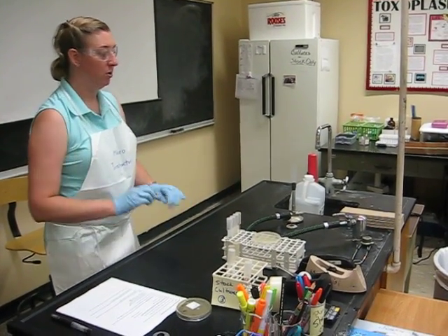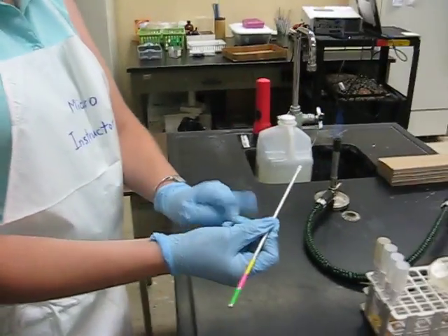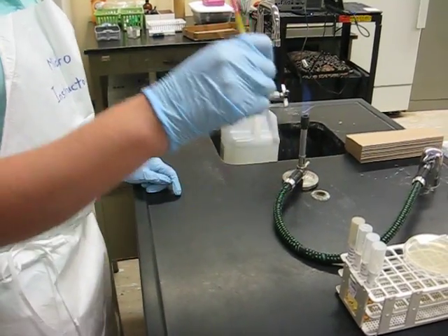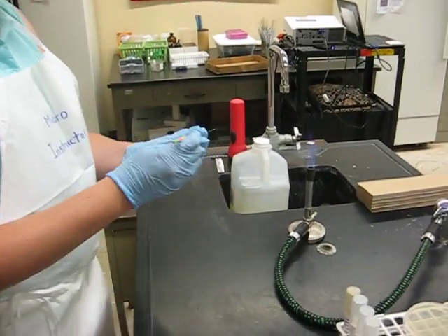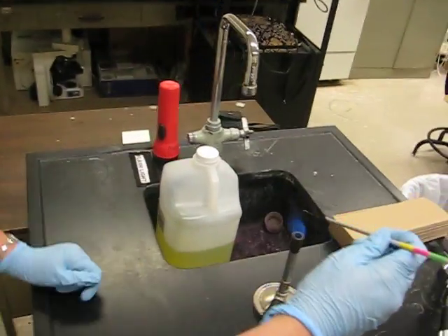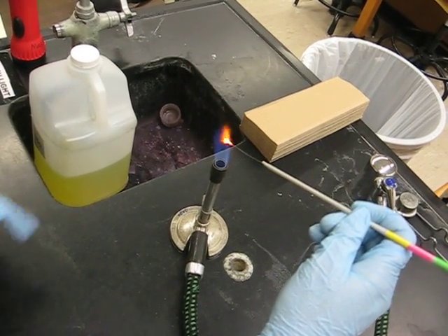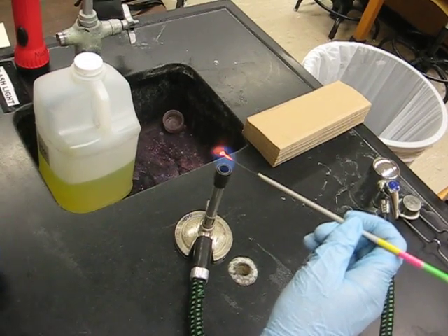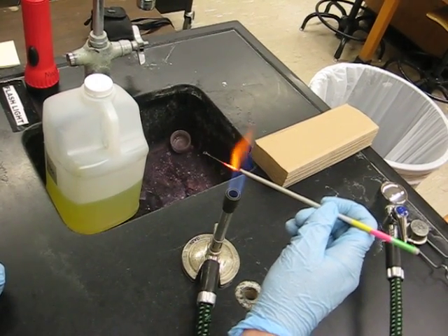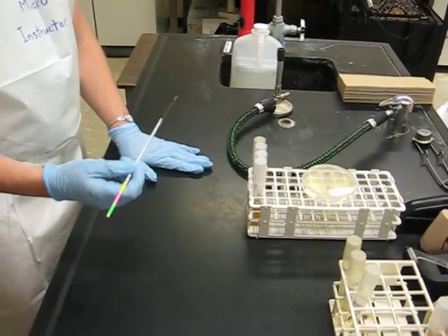I need to sterilize my loop. You hold your loop as if it were a handwriting utensil — forefinger and thumb resting on your middle finger. You want to almost be an artist with it. I'm going to go loop-first into the flame, and you want it to be bright orange — the whole loop. The hottest part of the flame is usually the top of the first arch. You want to go from the loop all the way to the beginning of your handle, and then it's sterile. If I put it on the desktop, even though I disinfected, it's not sterile — I'd have to reflame it. So you want to keep it in your hand.